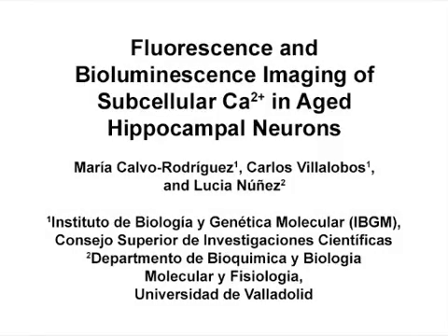The overall goal of this procedure is to investigate calcium remodeling in the aging brain using fluorescence and bioluminescence imaging of cytosolic and mitochondrial calcium in long-term cultures of rat hippocampal neurons, which is considered a model of neuronal aging.